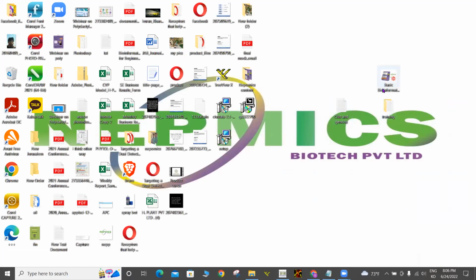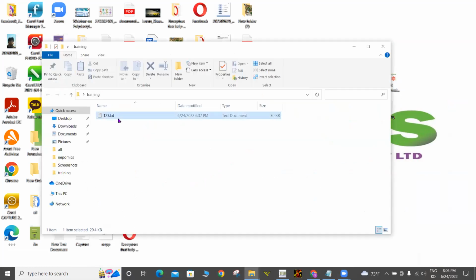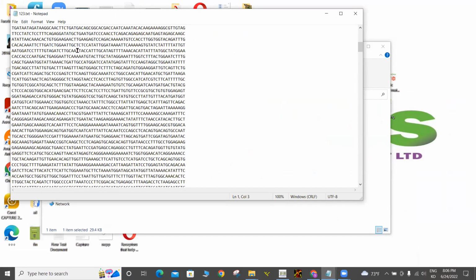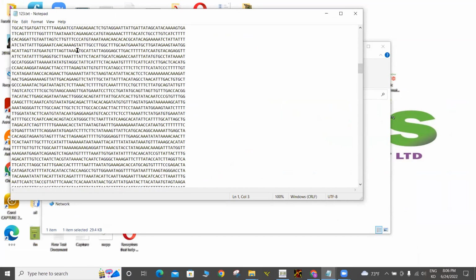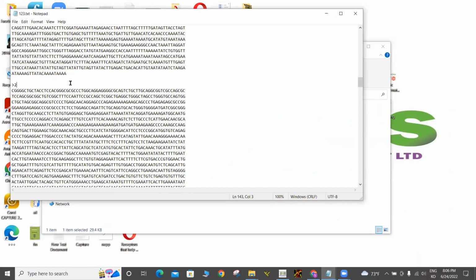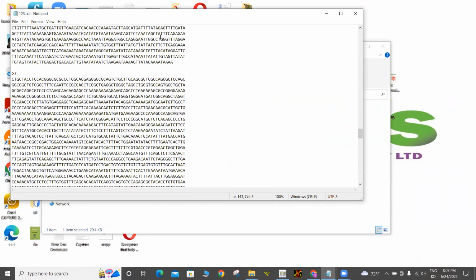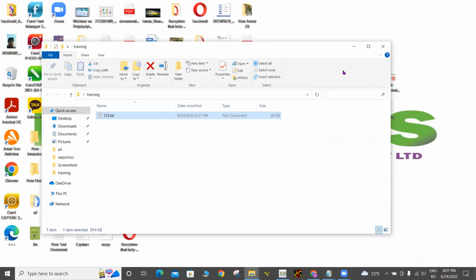For example, in case of mine, let me show you. I have separated the 3 sequences by 1, 2, and 3. So you can name your sequence yourself. For example, 1, and I have created NS sequences as 2 and then 3 there. Got it? Thank you. Yeah, exactly. Okay, thanks for the queries.